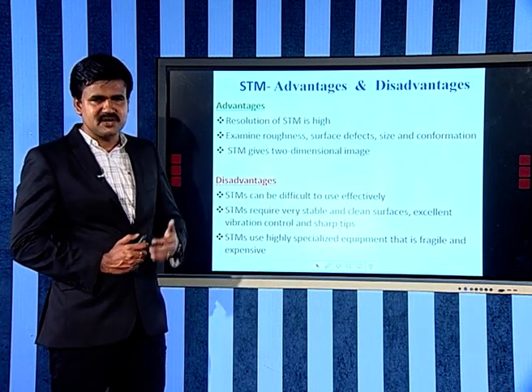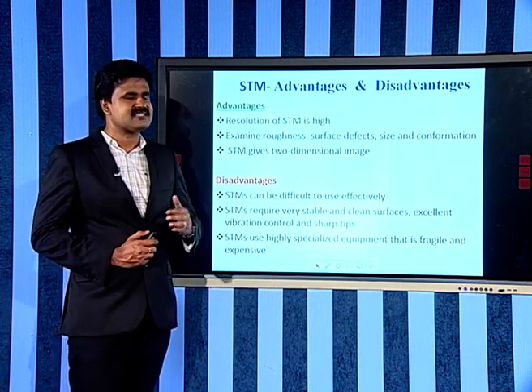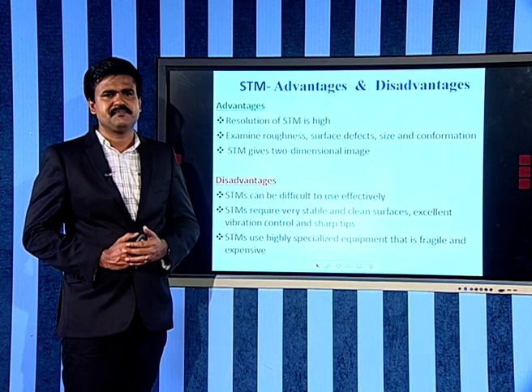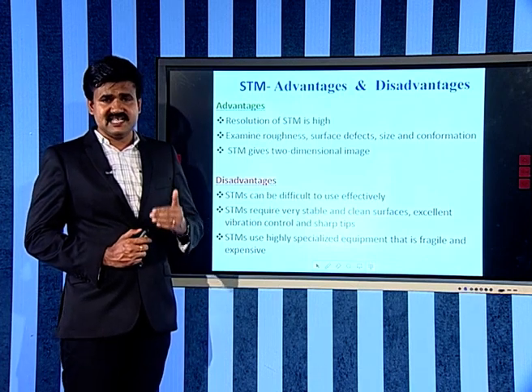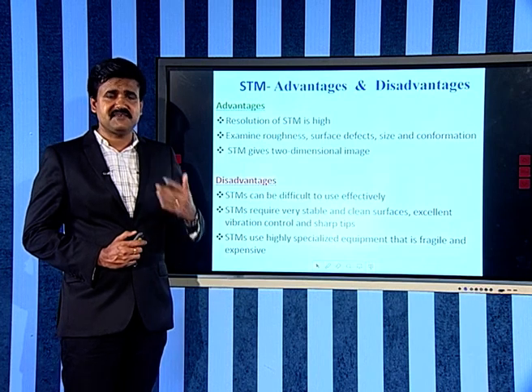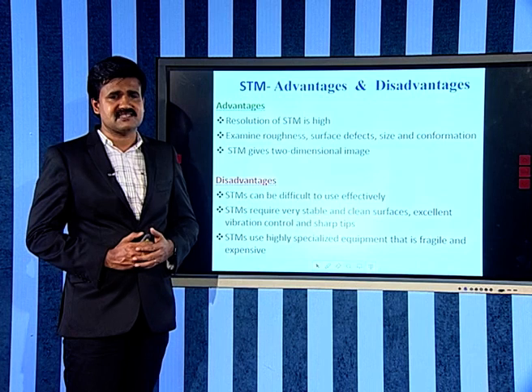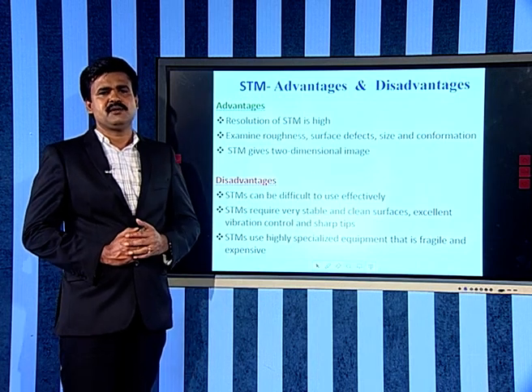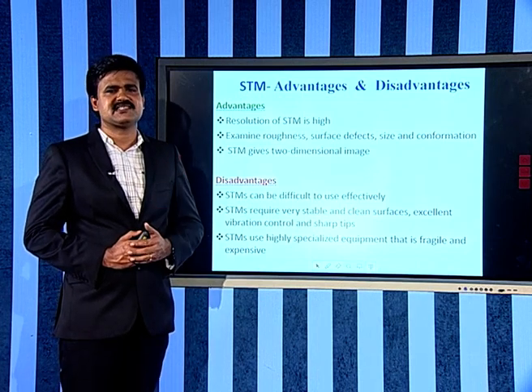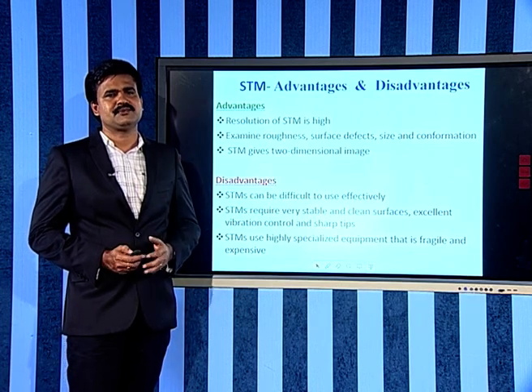Regarding the disadvantages, STM can be difficult to use effectively. It is not a cost-effective method. STM requires a very stable and clean surface, since the presence of impurities will definitely interfere with the analysis result. STM uses highly specialized equipment that is fragile and expensive.